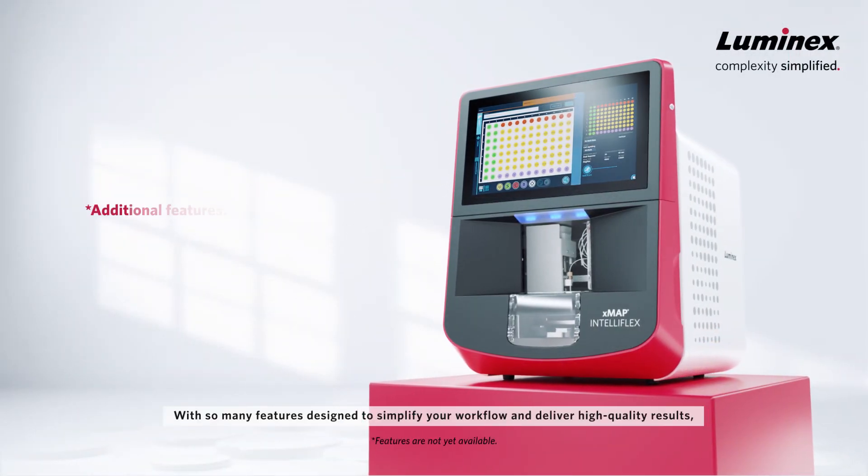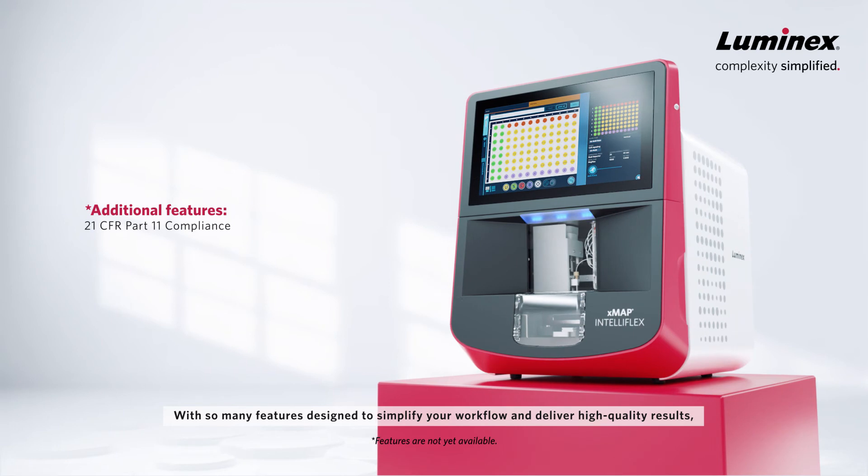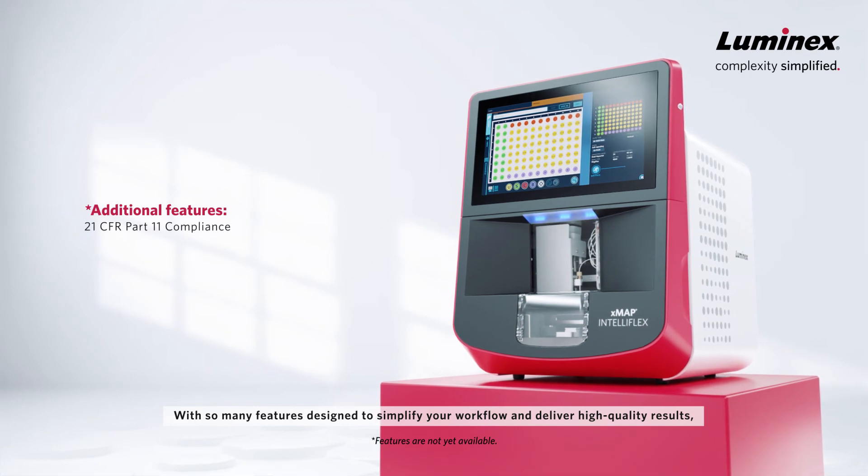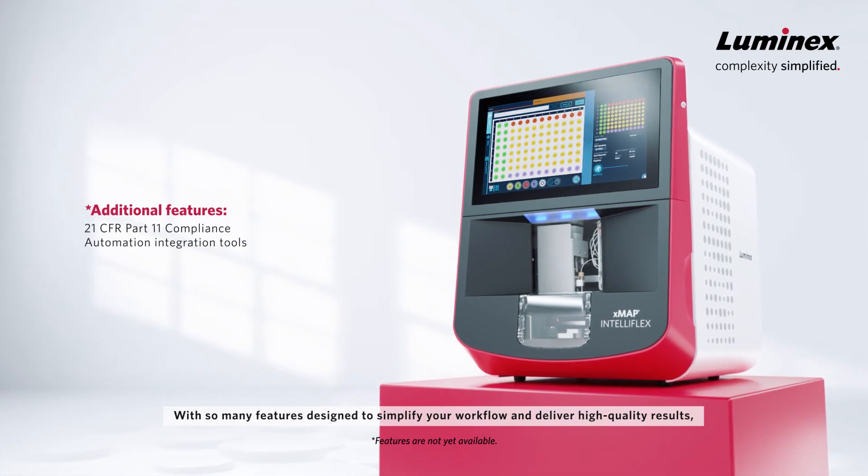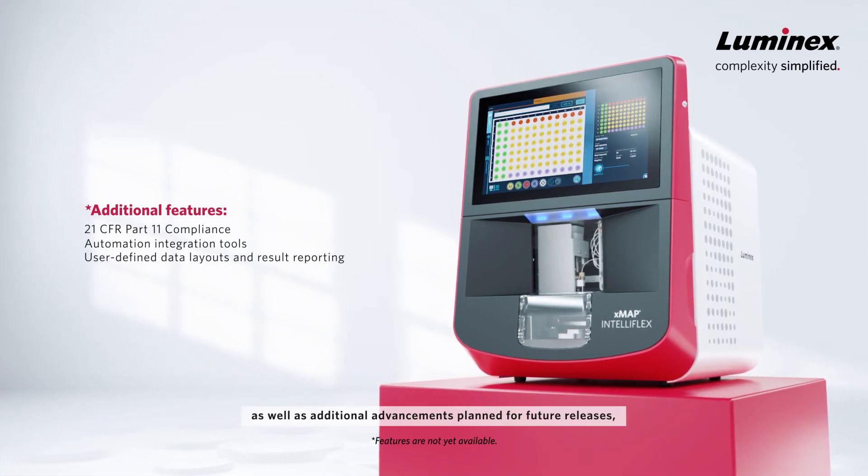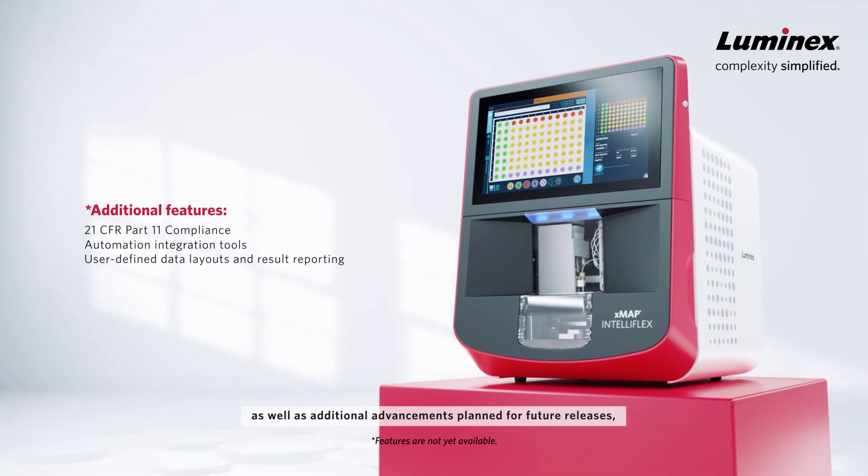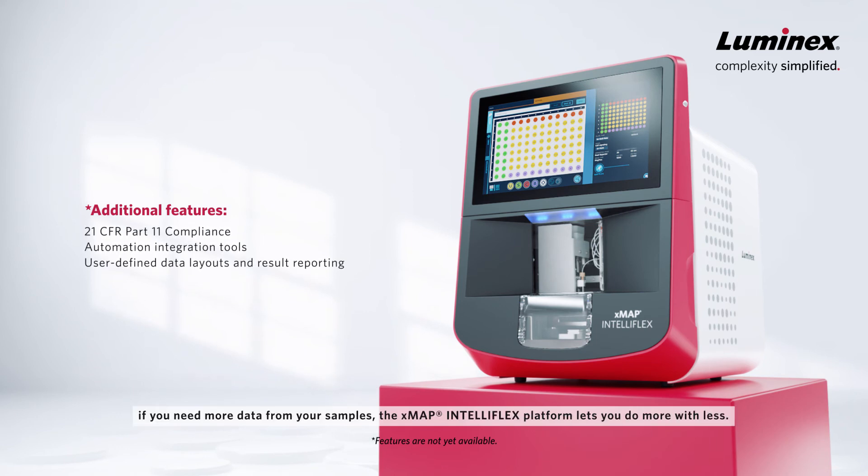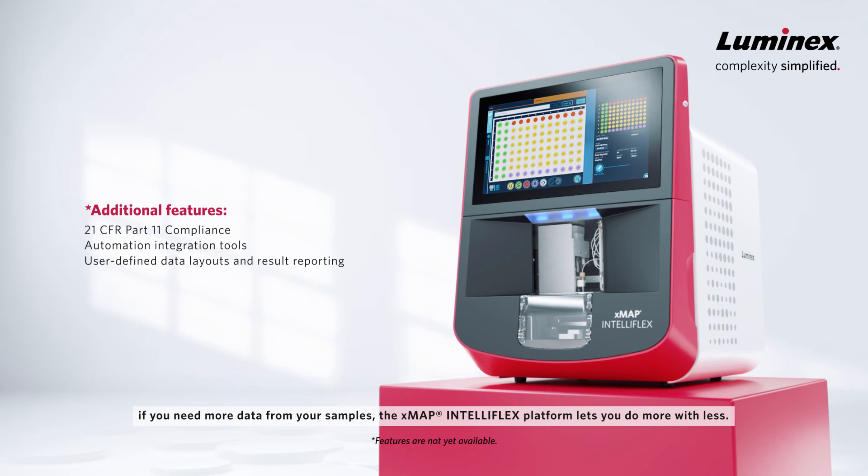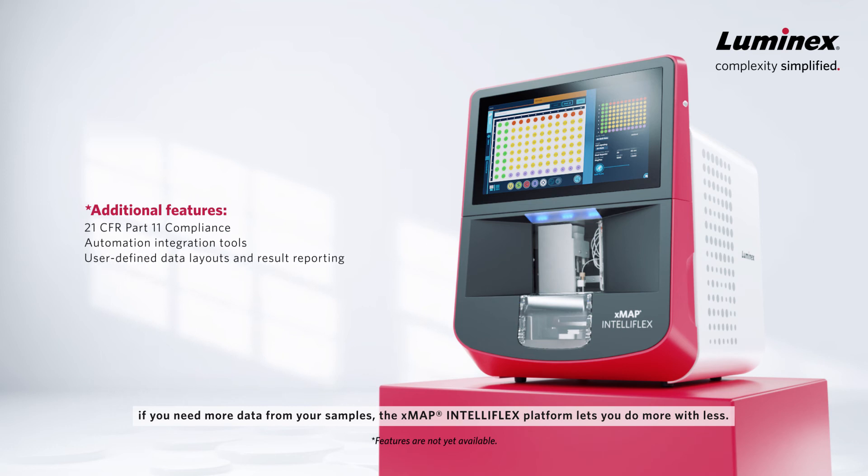With so many features designed to simplify your workflow and deliver high-quality results, as well as additional advancements planned for future releases, if you need more data from your samples, the xMAP INTELLIFLEX platform lets you do more with less.